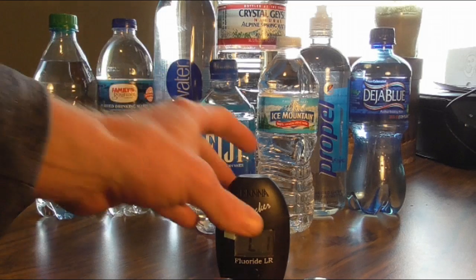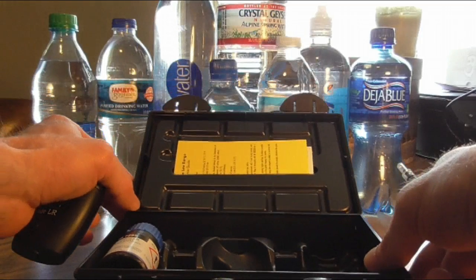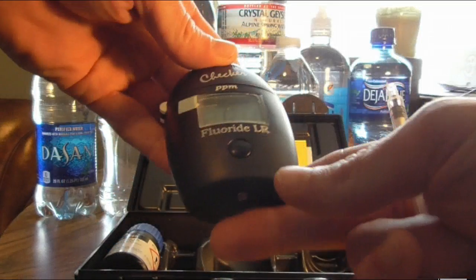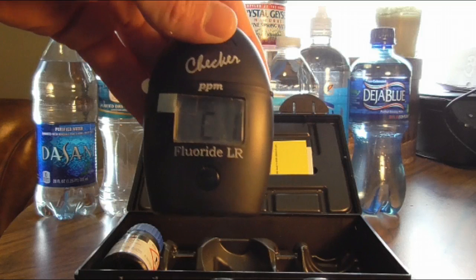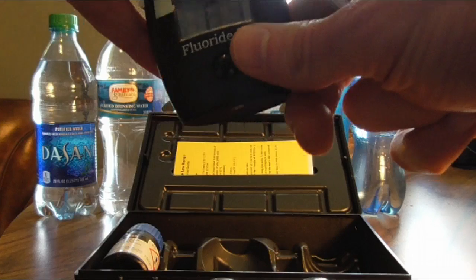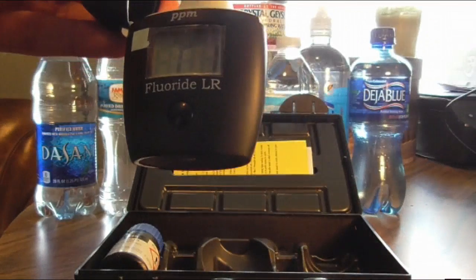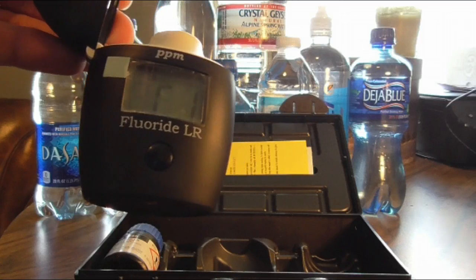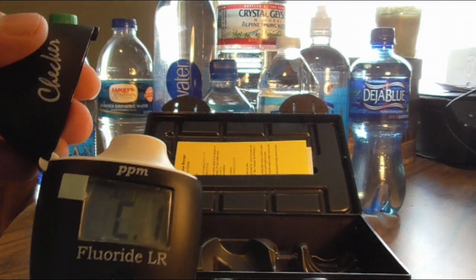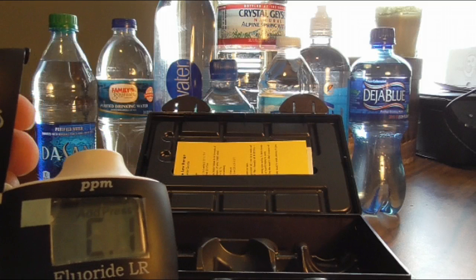Now in this process, this is awesome because you can get this device for around $50 and they have all kinds of different ones that test for different things. This one is specifically for fluoride and it works with a light bulb in it that reads it. It takes advantage of newer technology and makes it affordable for people to be able to check things like the water you're drinking and even the tap water at your house.